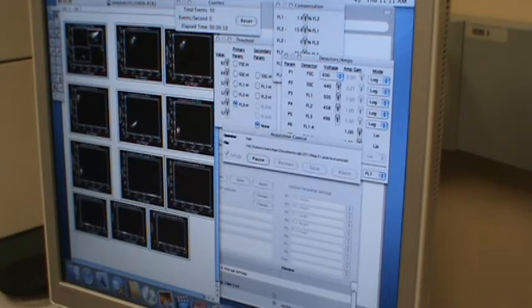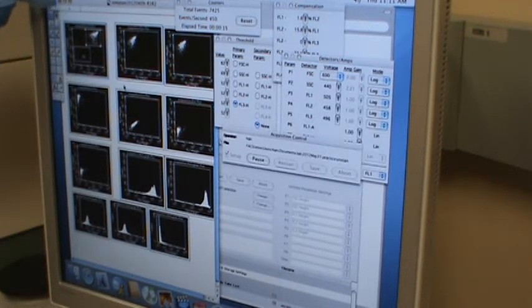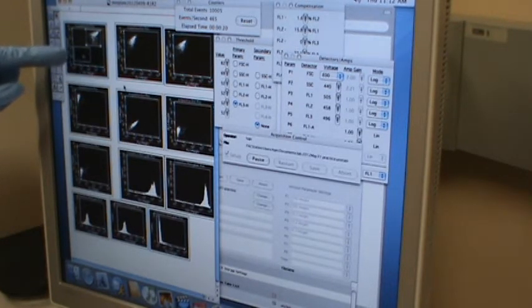Oops, it's not changing. Now it is increasing. I want to gate the majority of the cells that are there. So that's the non-stained cell. Remember, FSC is cell size, SSC is granularity. That's the cell. For some reason now we see very few dust. That's a good thing.